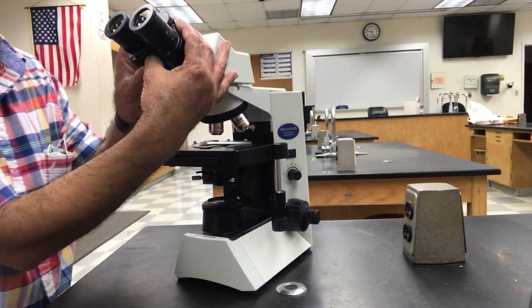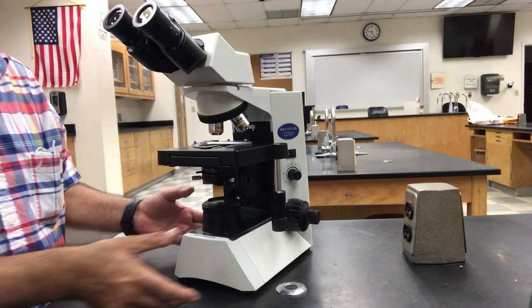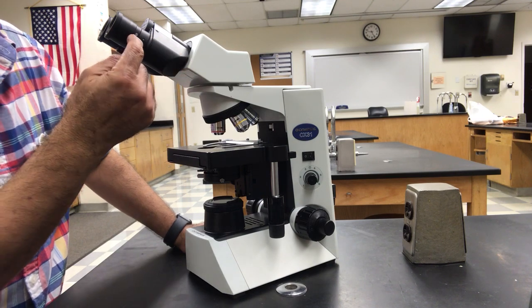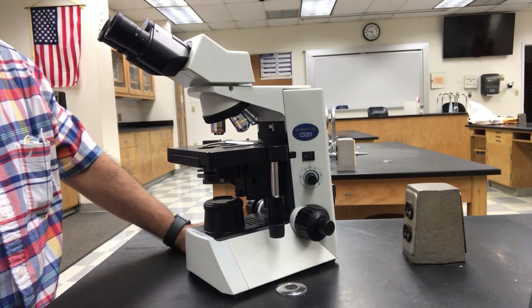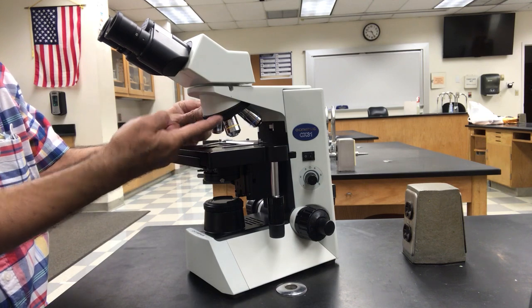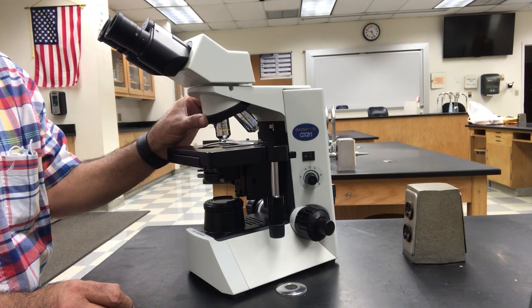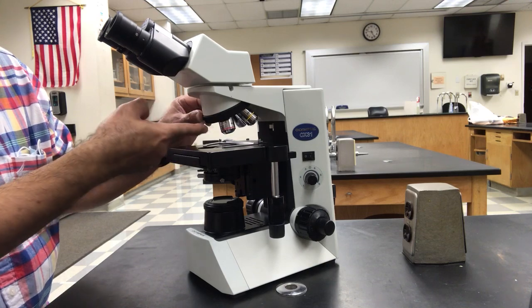As you can see, the ocular lenses could be adjusted. You may have a question about the magnification power of these lenses. It's actually printed on the lens. The ocular lens can magnify 10 times. The objective lenses are screwed onto this revolving piece. What I'm touching and holding, that's called a nose piece. It has these three objective lenses.